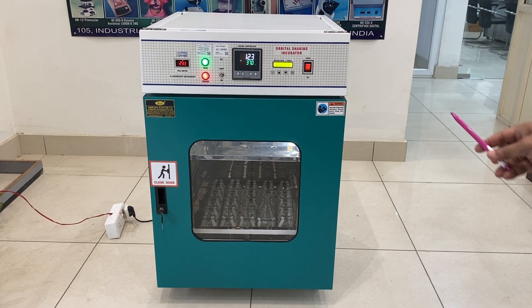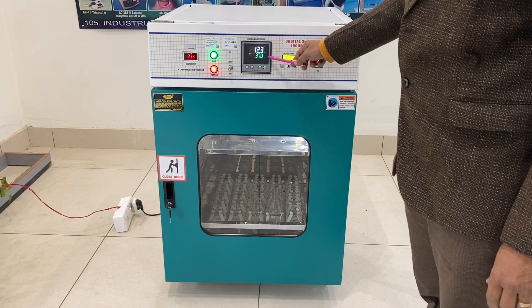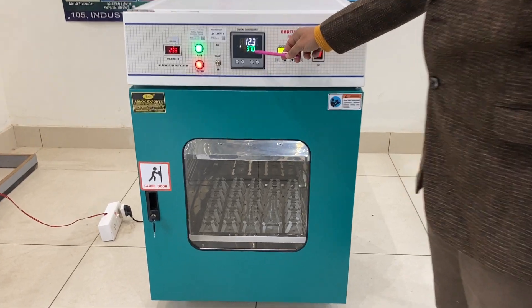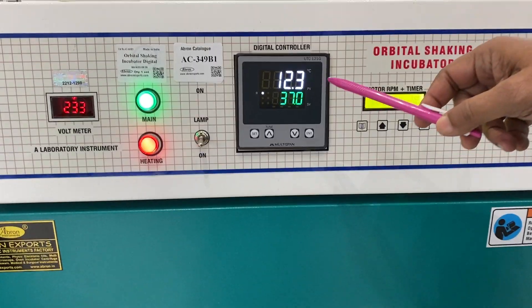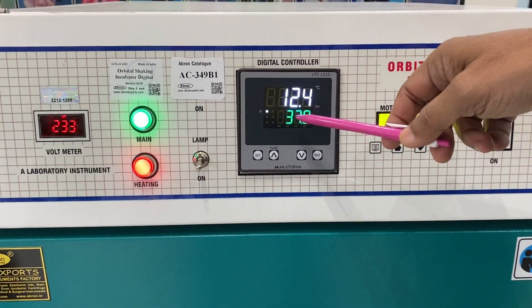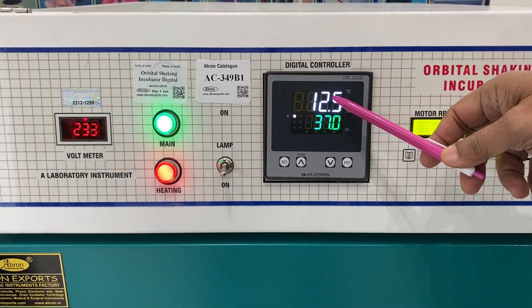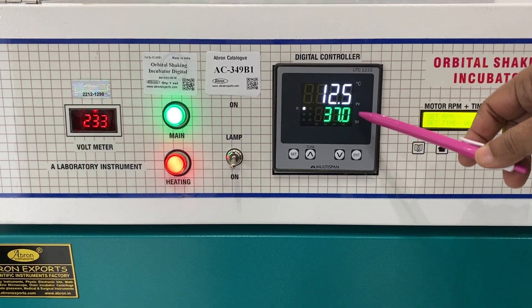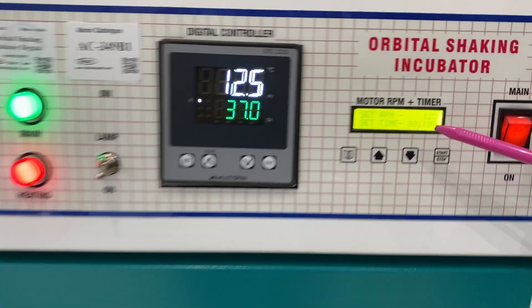This is an orbital shaker incubator by Brown Export. We have a digital PID controller. It can control the temperature from room temperature — though today it is almost 11 degrees in our city — so from plus 5 degrees above room temperature to 37 or 50 degrees.